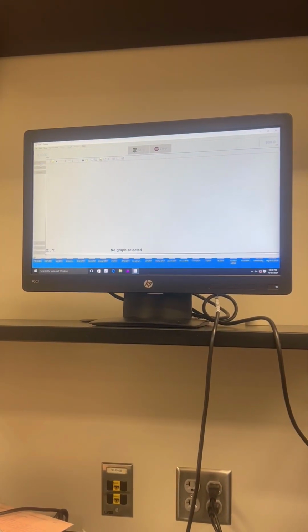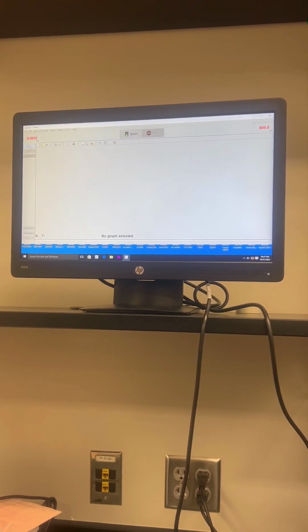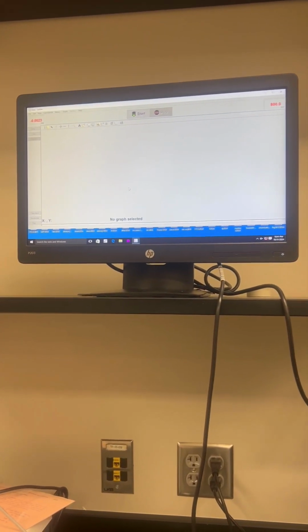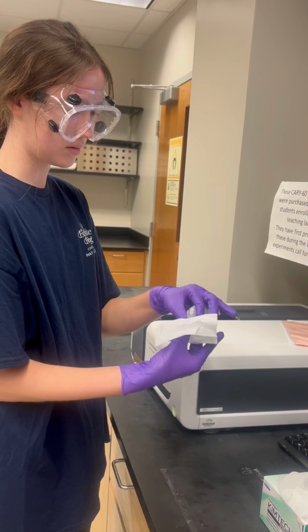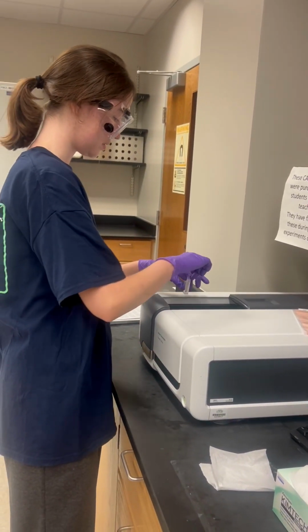Use a chem wipe to clean the two sides of the cuvette that the beam will pass through once placed in the machine. Close the lid and hit 0. Carefully remove the cuvette and close the lid. Follow the same process for your samples, always remembering to wipe two sides of the cuvette first, but hit start to scan for absorbance. Remember to make sure the spec area is clean before returning to the lab and washing your glassware.